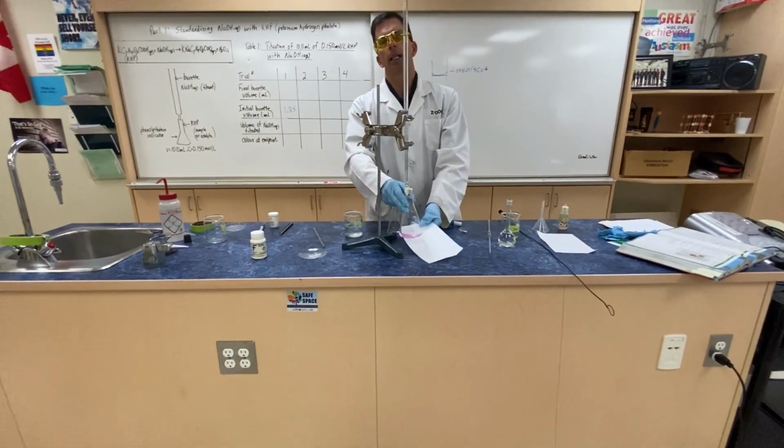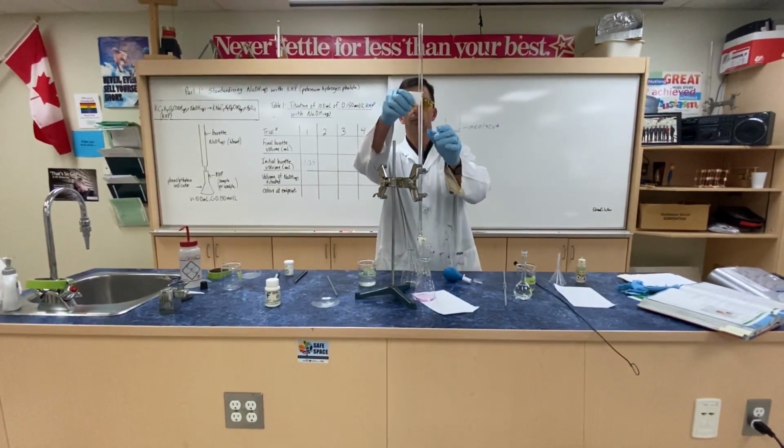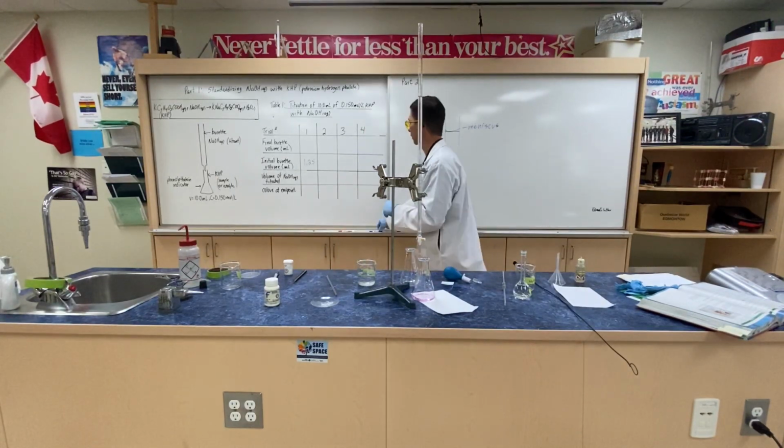So Zdog's going to take the reading, and then he's going to put that on the table, and when we subtract that, that gives us how much we've used, which is pretty handy. All right, that's 14.10 milliliters. Holy cow, okay.